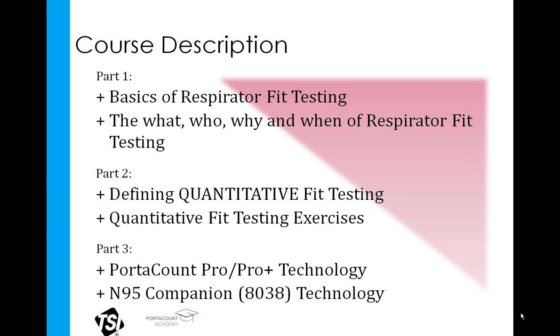In Part 2, we're going to talk more specifically about a method of quantitative fit testing, defining some of the terminology often heard in this regard, and step through the prescribed procedures. In Part 3, we're going to talk about the technology used by the PortaCount Pro in order to perform accurate fit testing, and I'm going to discuss the differences between the 8038 PortaCount Pro Plus model and the 8030 PortaCount Pro model.